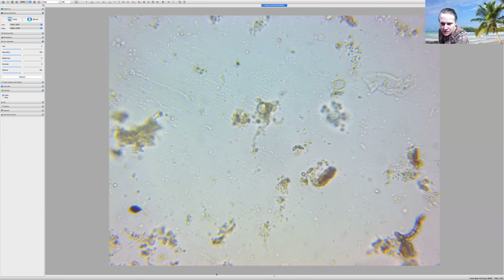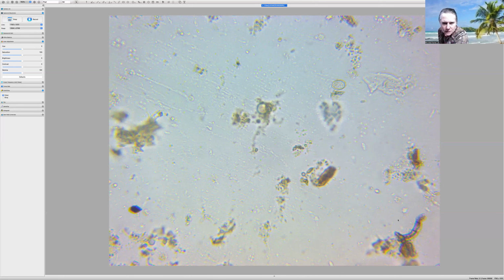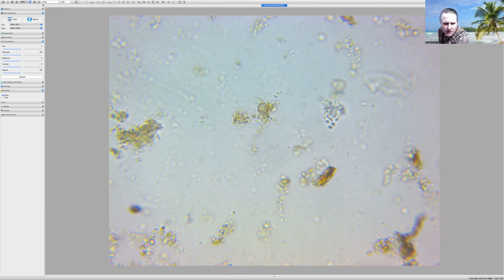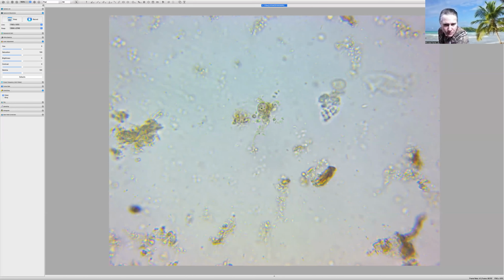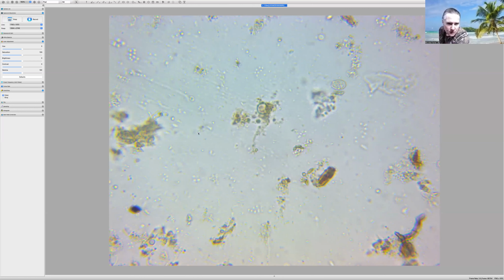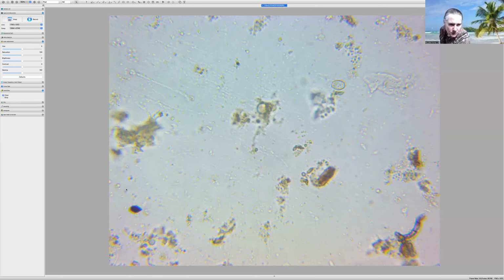So, testate amoeba, okay, and let's say right here. If you look at this, this is a septa, and I believe septa there. So this is a beneficial fungi that would be counted in our fungal to bacterial ratio. That is a possible Arcella, which is an amoeba, but I don't see its opening, and it's most likely on the back side. So I cannot tell you for sure unless we could turn her around.